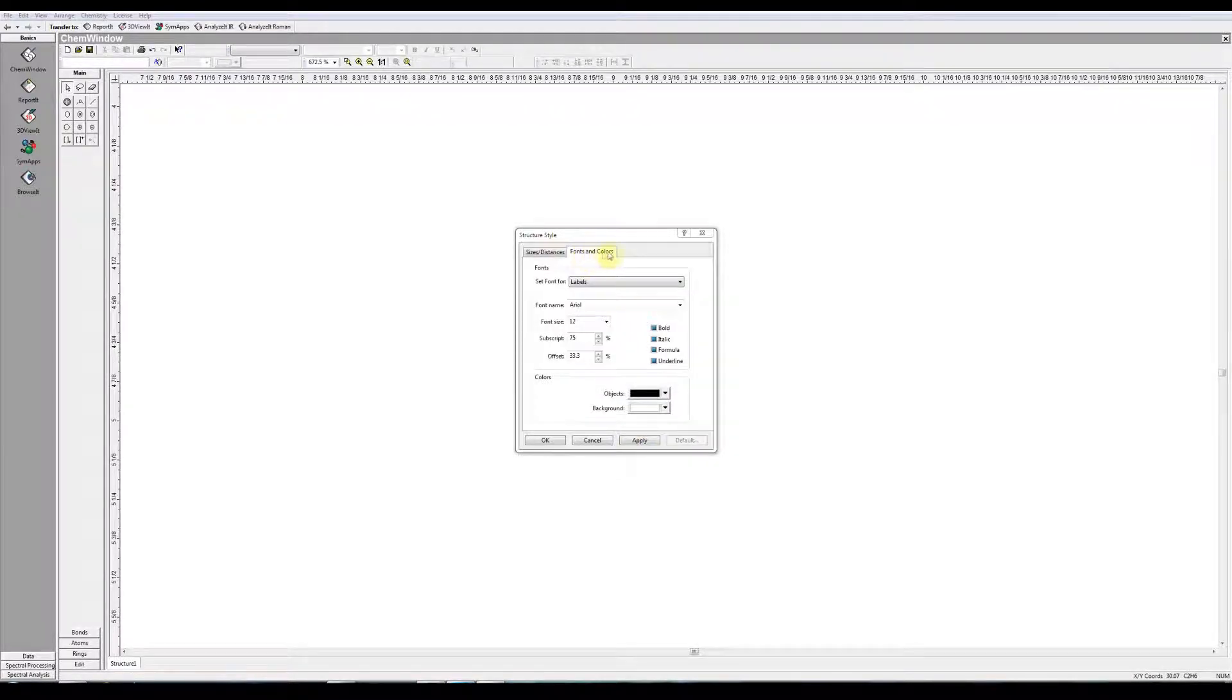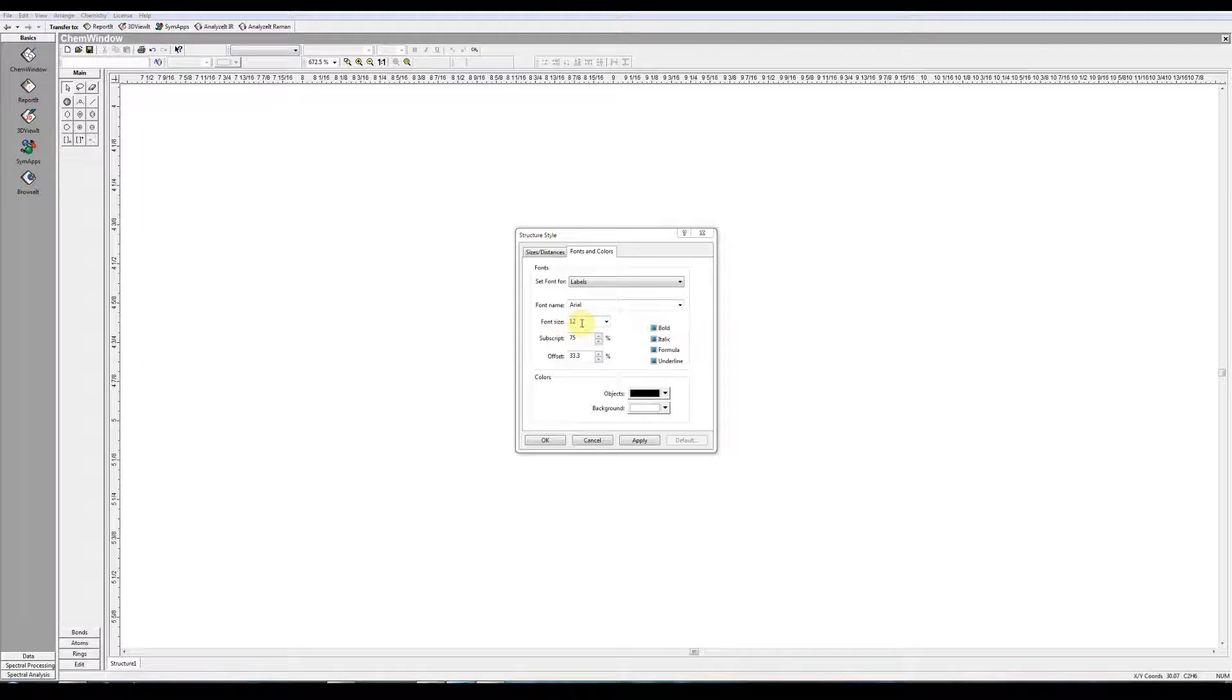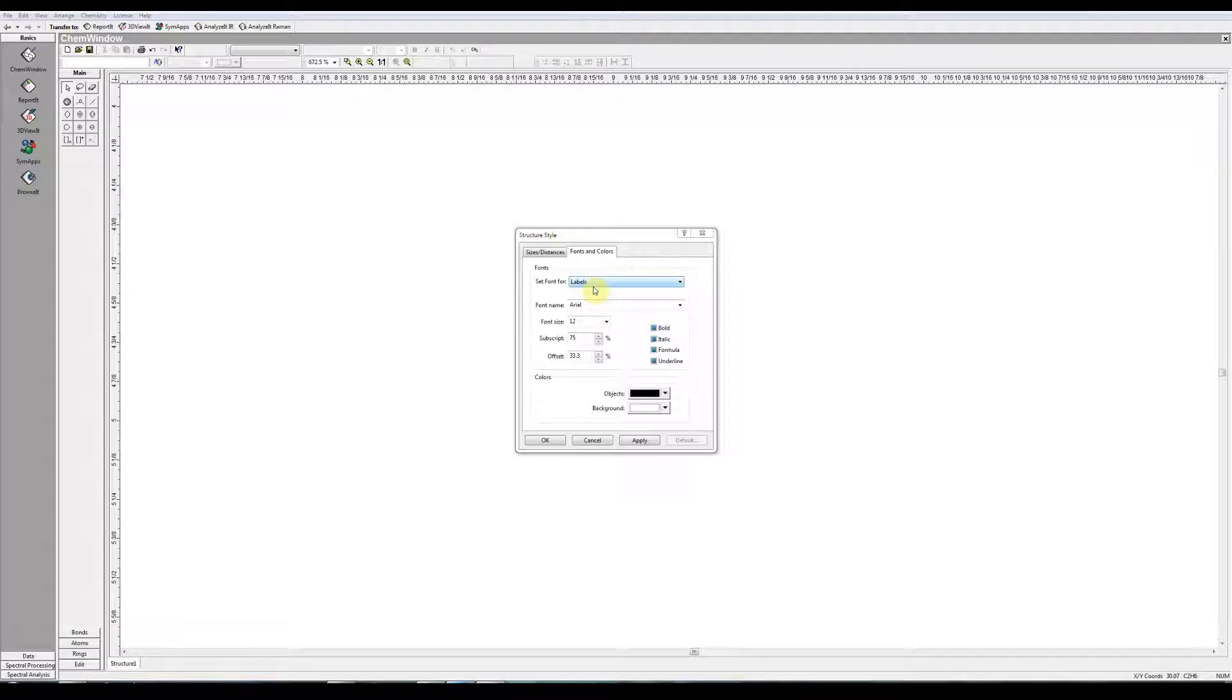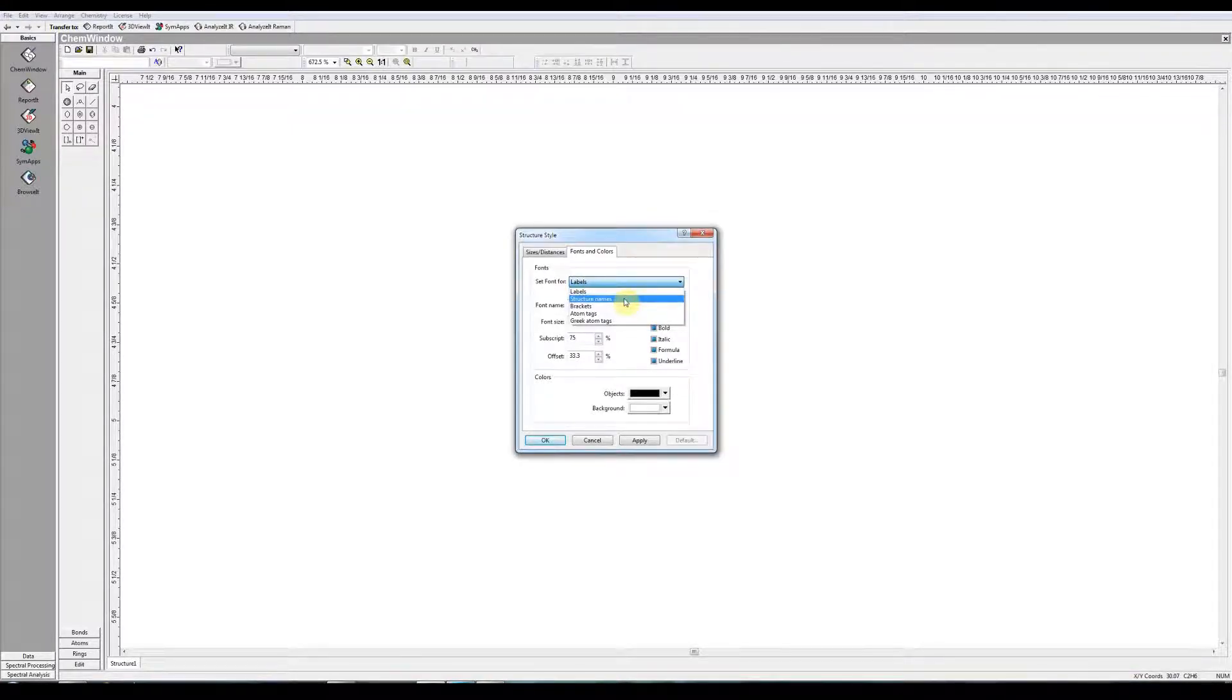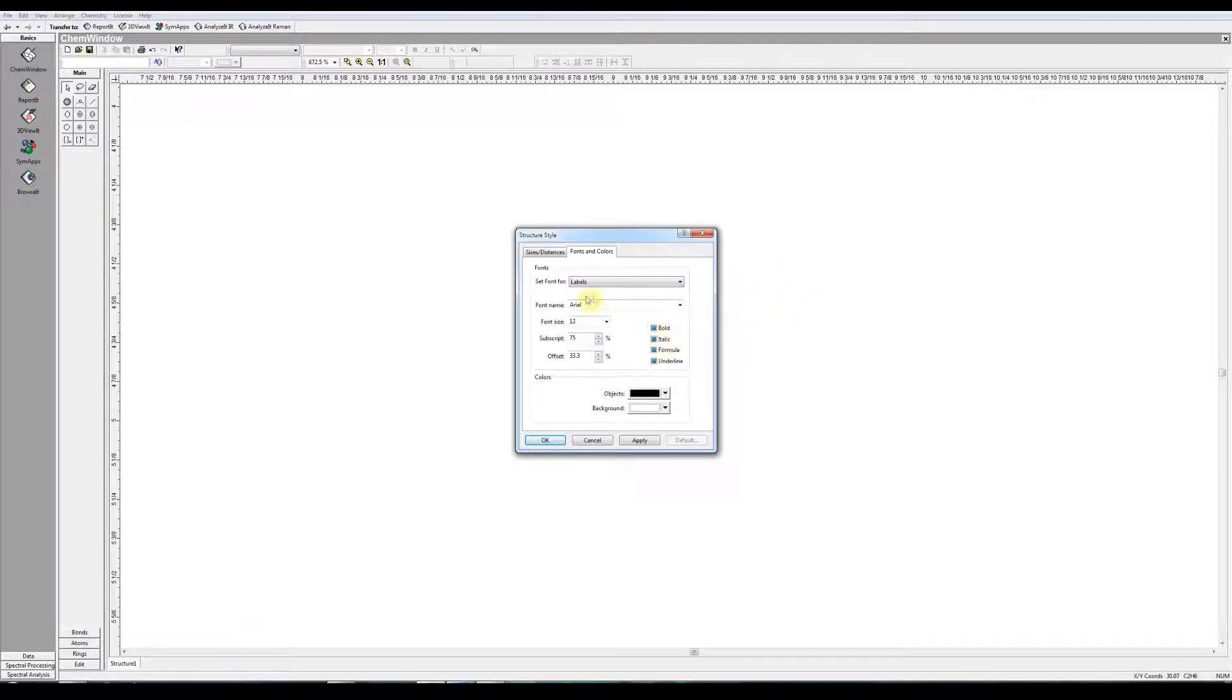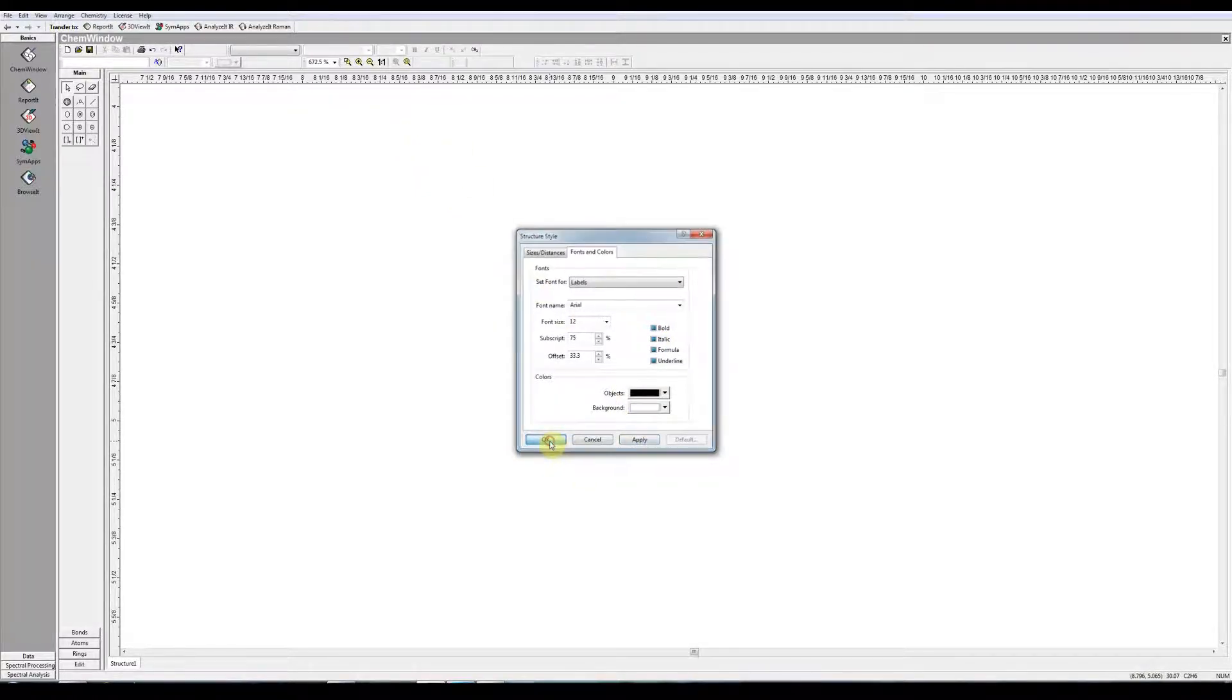Under the Fonts and Colors tab, you have options to choose the font type and size, and the subscript size and offset for labels. Labels are the characters or letters that are used in structures and in formulas. Now these can also be set on the main screen afterwards. If you make a change, just click Apply and say OK.